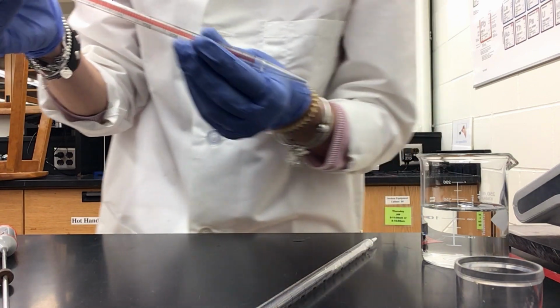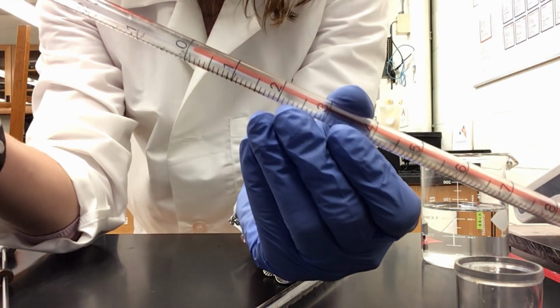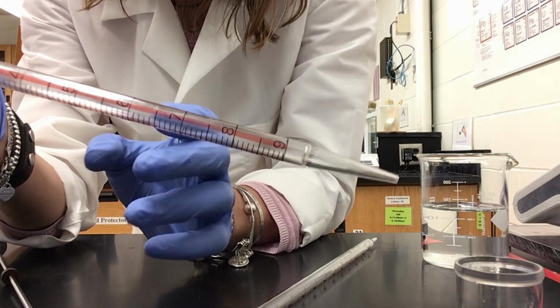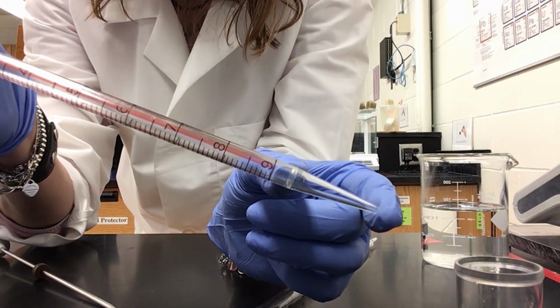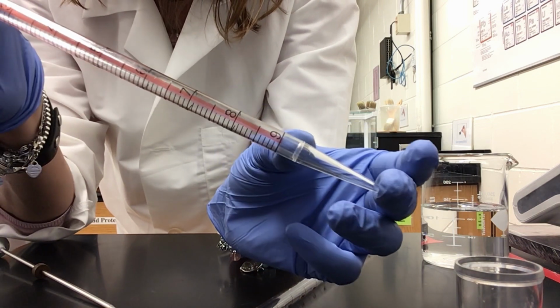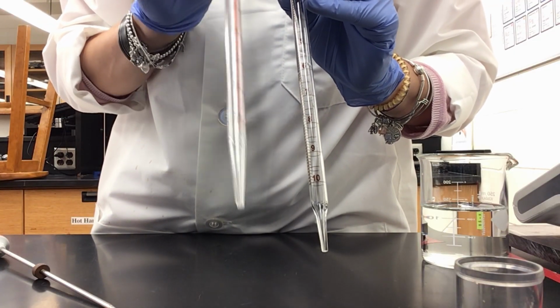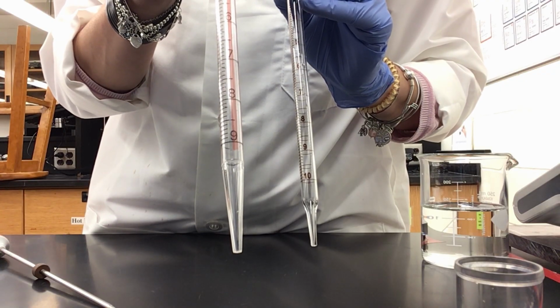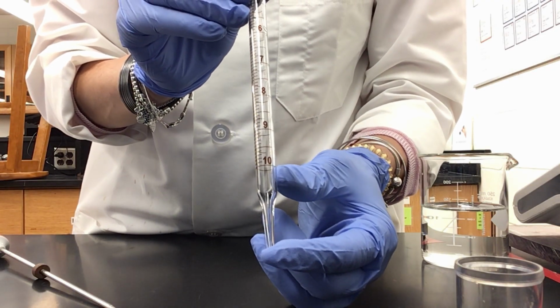Okay, this other brand has the 0 marking right here, exactly like the other one, but there's no 10 milliliters marking, so it arrives at 9. This is because the tip of this pipette measures exactly 1 milliliter. So this is actually the 10 milliliter marking, okay? So can you see the difference between the two? Okay, so here with this one, where the 10 is not indicated, it means that the tip is 1 milliliter. Here, where the 10 is indicated, it means that the tip doesn't need to be counted.